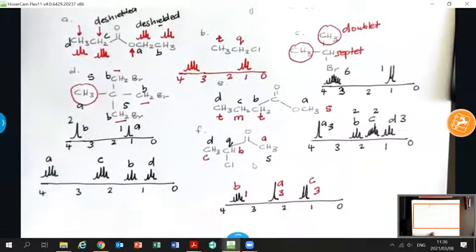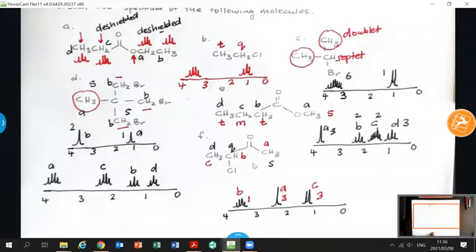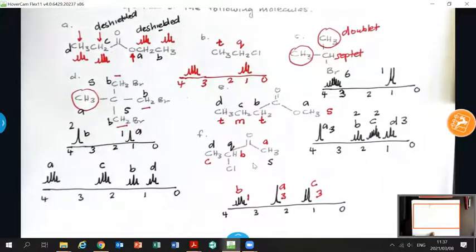All right, so generally you can take any of your molecules that you see, and once you know about chemical shift and the atoms that affect the chemical shift. Here I've used a bromine atom as an electronegative atom. I've also used a chlorine atom and an oxygen atom as electronegative atoms to show you that those atoms will de-shield the protons on a carbon. They will take electron density from them and shift the signal.